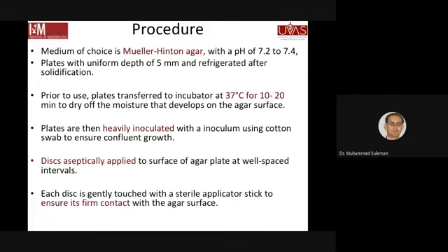growth. जो आपने पेशेंट का सैंपल लिया था स्वाब के ऊपर, उसको आपने एनरिच किया, ग्रो किया, and then once you have grown it, that culture will be the source जिसके ऊपर आपने एंटीबायोटिक सेंसिटिविटी करनी है. तो उस कल्चर में से आप जो है वो अगेन स्वाब लेके आप अपनी जो प्लेट है मुलर हिंटन एगर की, उसको पूरी को आप स्वाब कर देंगे, उस पर फैला देंगे.